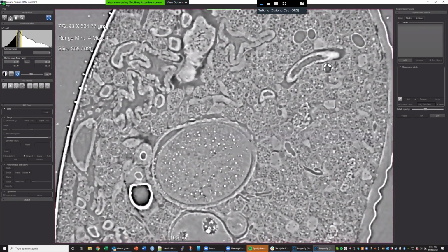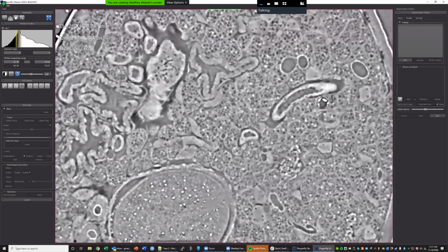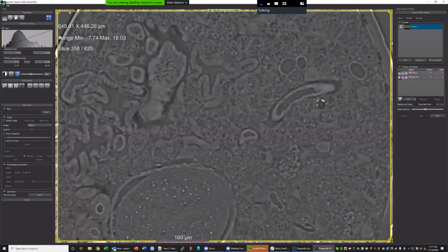Because I see the problem sometimes too. If I try to grab and drag, I can't grab the handles. Normally it should be okay. For me, sometimes yes, sometimes no. I think it's just good to use one frame for now?